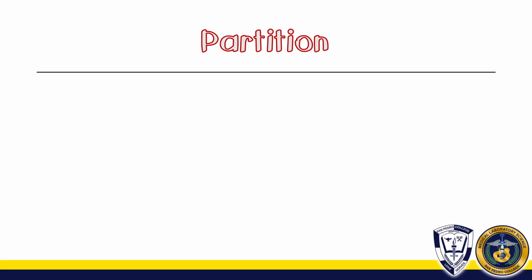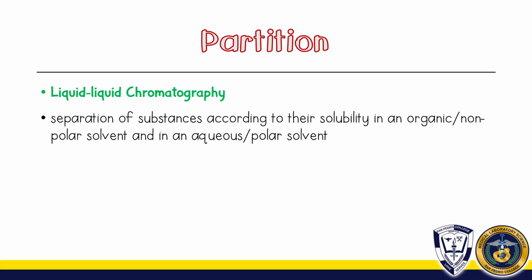Next, now we go to your partition chromatography. Partition chromatography is an example of a liquid-liquid chromatography wherein separation of substances is according to their solubility. Again, solubility is the basis of separation, in an organic or non-polar solvent and in an aqueous or polar solvent.